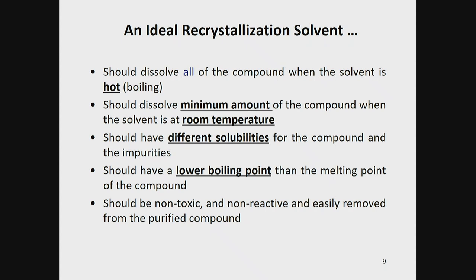And lastly, the solvent should be easily removed from the purified compound. Okay, so we can separate the solid from the solvent via filtration. But if it can't be removed this way, it's going to be very difficult to work with. So there are a lot of factors that play into this recrystallization solvent. Now you'll notice that we're using the terms crystallization and recrystallization interchangeably because they're synonymous with each other.